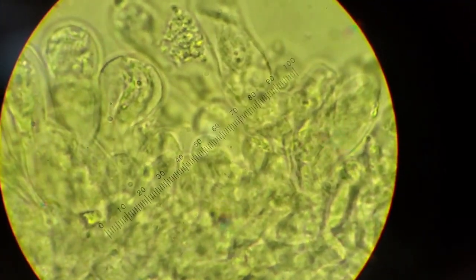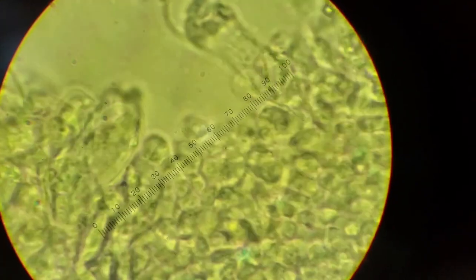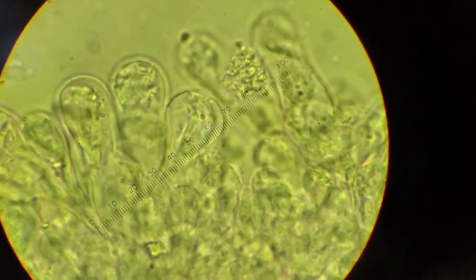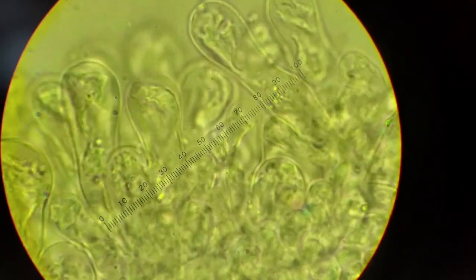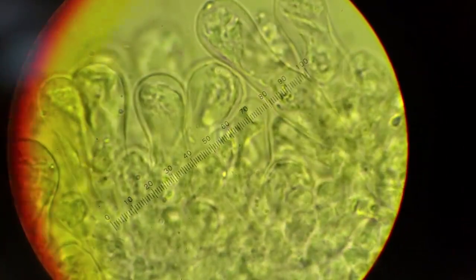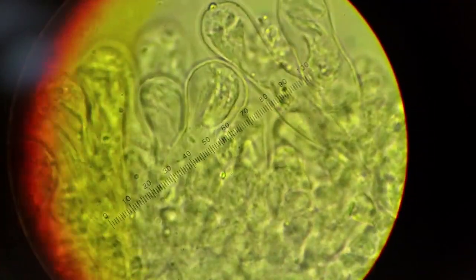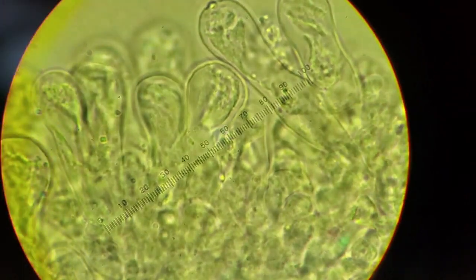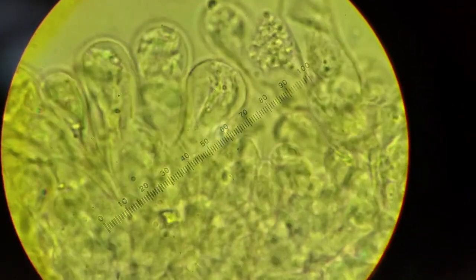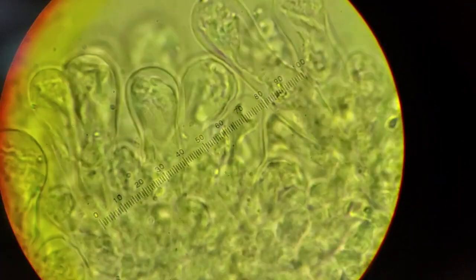Okay, so here is a good part that I found in my sectioning, because it lets you see the structures with the basidia much more clearly without so much difficulty of trying to see between so many cells. And you can distinguish where the base is. You can measure the basidia at this point. You can measure their length, their width, and you can see the structure and the shape a lot more clearly.